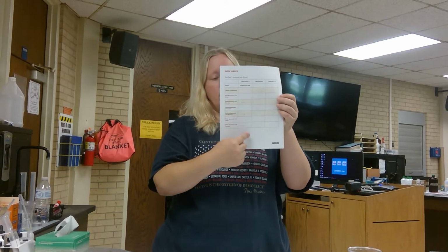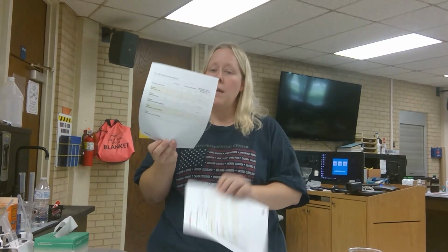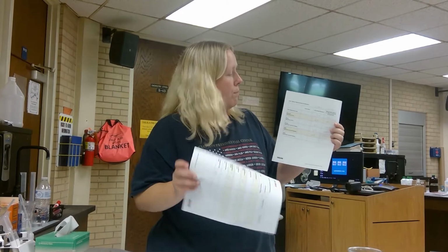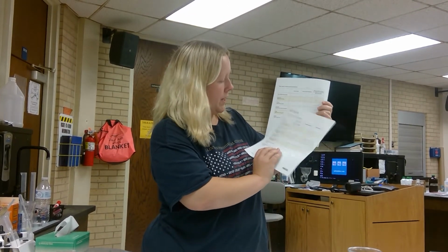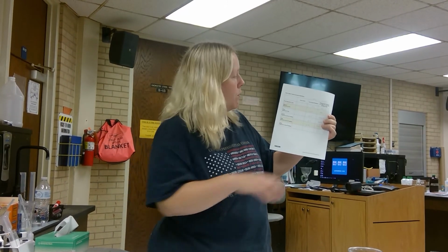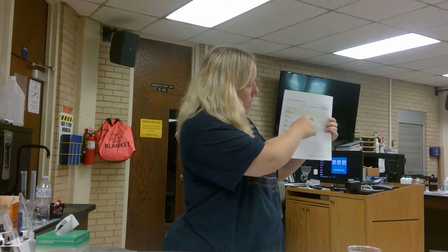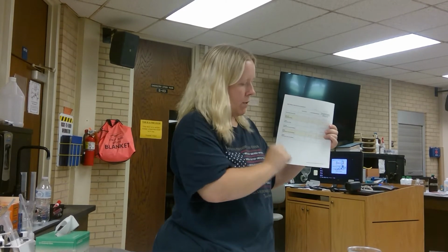But the 3 numbers from this column here must appear on this sheet. This is data table 2. So the 4.4, the 4.9, and the 5.4 that I got on data table 1, I put in this column right here, 4.4, 4.9, 5.4.